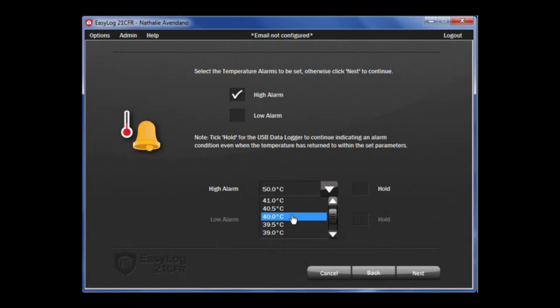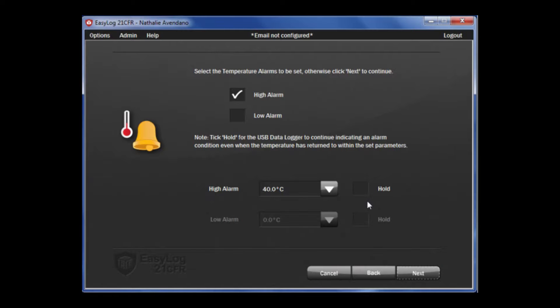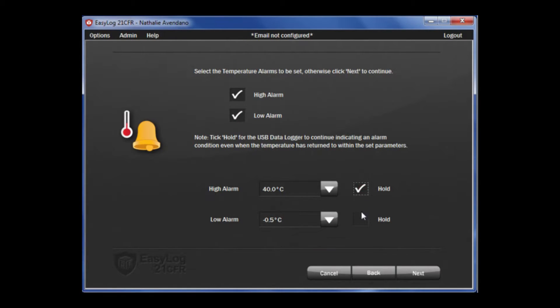You will note, to the right hand side, that there is a tick box saying Hold. This is a feature that will continue to show an alarm condition even if the temperature has returned to a normal condition. I will do the same for the low alarm and select the appropriate temperature, then select Hold for both of them. If you wish to not set up temperature alarms, leave the boxes unticked and click Next.